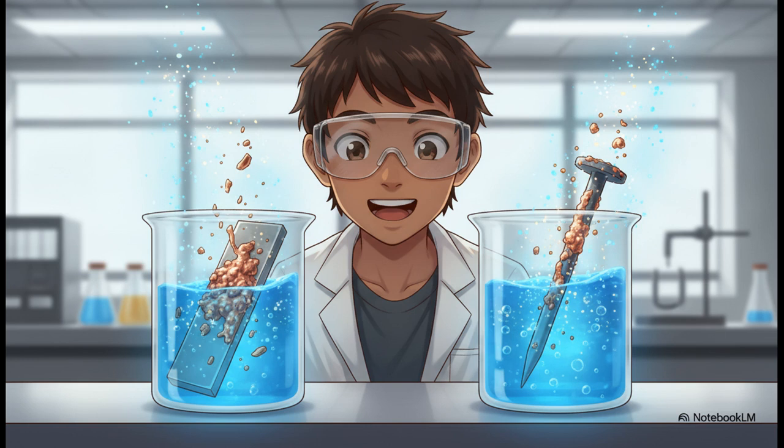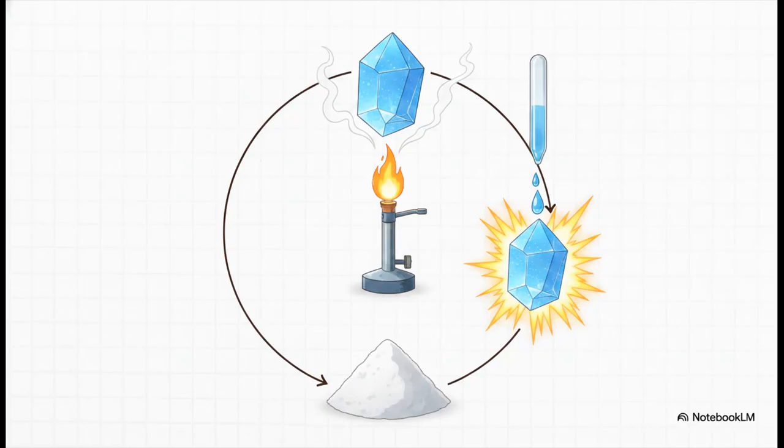Because it's so eager to absorb electrons and form metallic copper, it makes a perfectly reliable cathode solution or electrolyte for galvanic cells. Literally an absolute staple in high school chemistry labs everywhere. Another reason it's so beloved in education is for demonstrating mineral hydration.